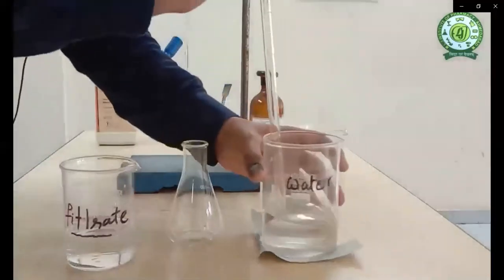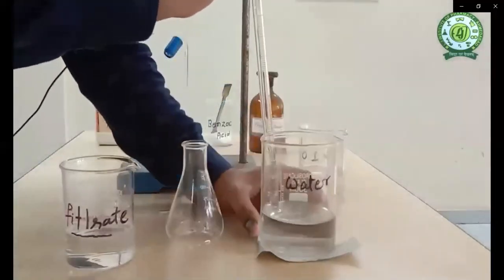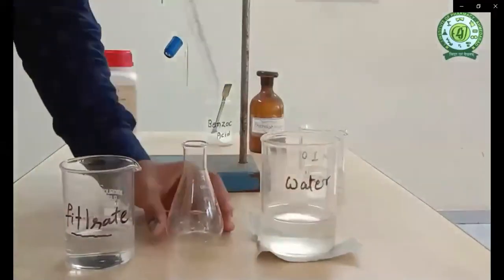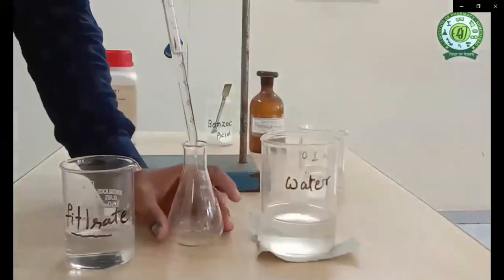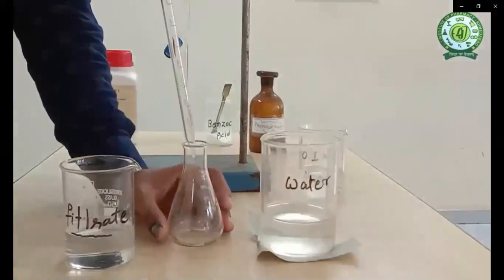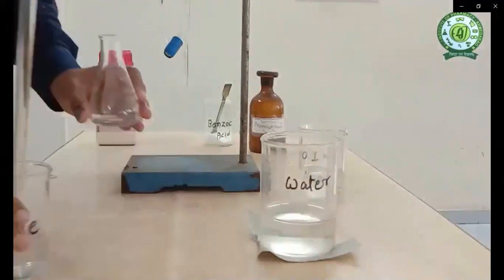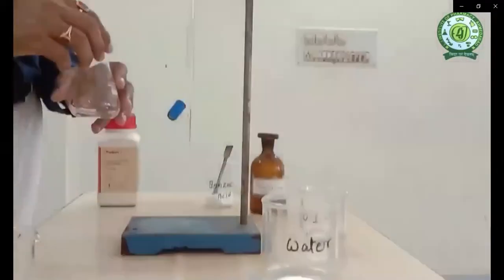Then we add 9 ml of distilled water into it so that it will form a 10 ml solution. So now our solution for titration is ready, that is 1 ml of filtrate and 9 ml of distilled water.